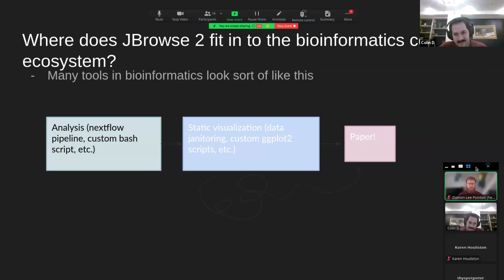Excuse me. I'm sorry, the colors are really bad on this.